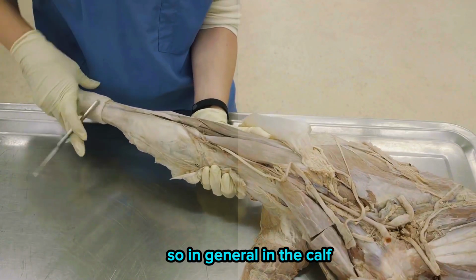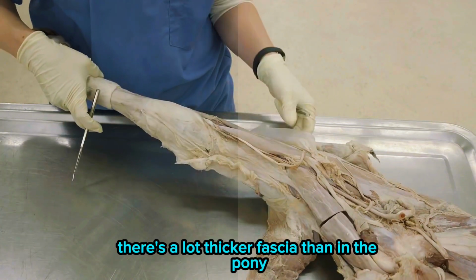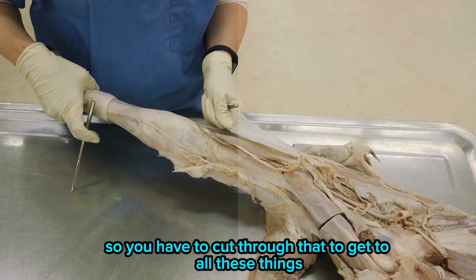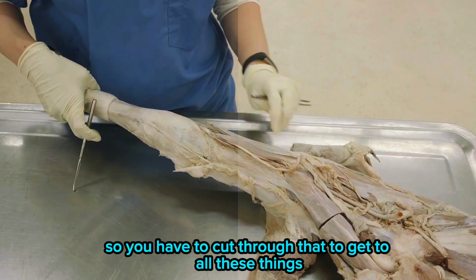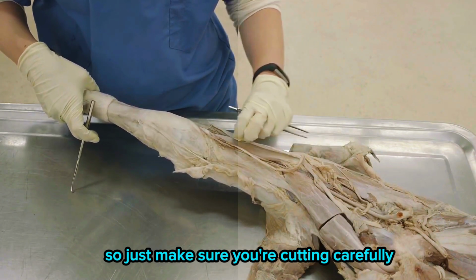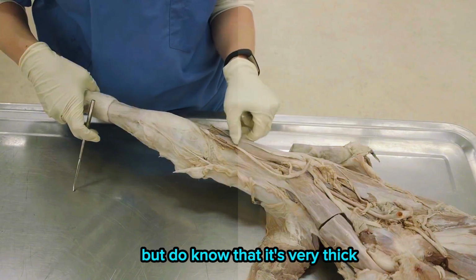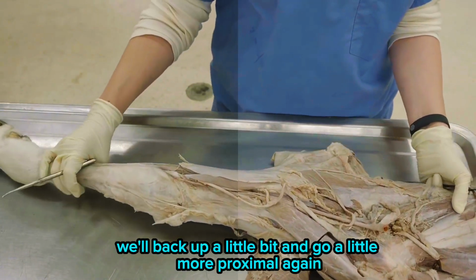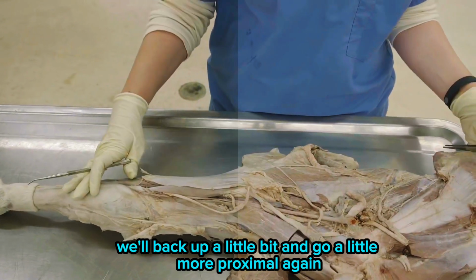In general, in the calf, there's a lot thicker fascia than in the pony. So if you see this, this is really thick and tough. You have to cut through that to get to all these things. Make sure you're cutting carefully so you don't cut the nerves and vessels, but do know that it's very thick.